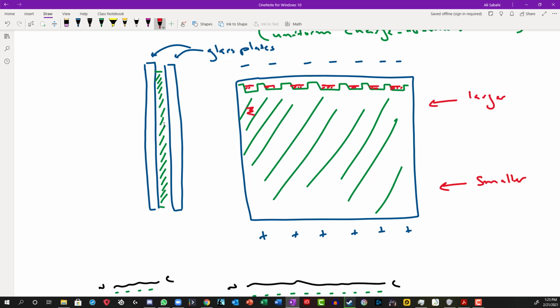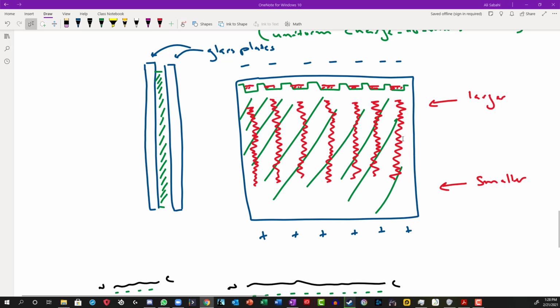So the proteins will start to separate based on size, but you'll basically get a smear, because we're talking about total cellular proteins. This does not give us a lot of information, but this is just the beginning of doing a Western blot. It's the first step. Of course, a smear doesn't tell us much, and usually on one of these lanes you will run a protein ladder. And what is a protein ladder?